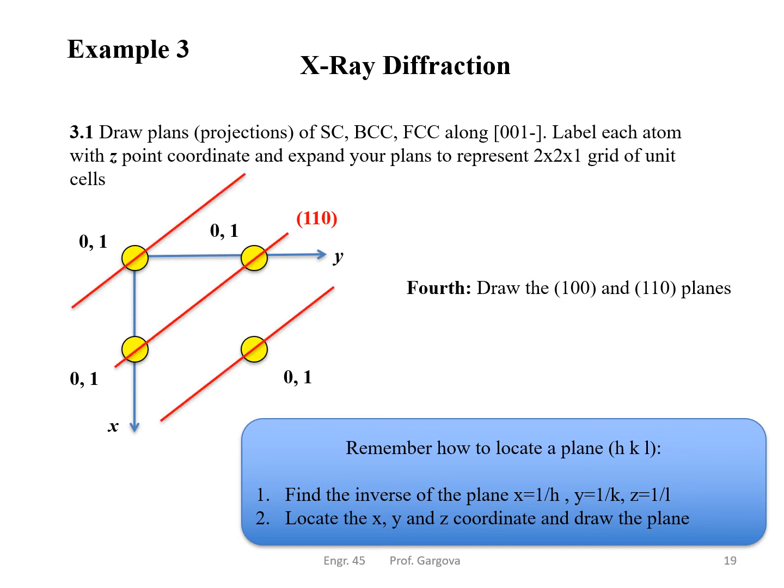And so we draw a family of 1, 1, 0 planes that looks like that. There's not really any interference that would occur with this arrangement of atoms if we were to bring an incident X-ray and have it reflect on these planes, both in the 1, 0, 0 and in the 1, 1, 0 plane.